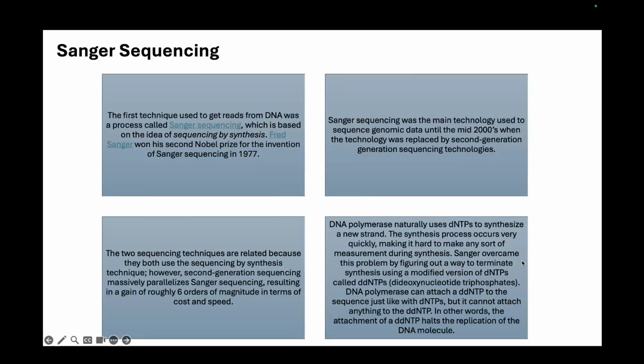The issue is that if you are trying to sequence a DNA strand by synthesis, the synthesis will proceed one after another in a serial way, but you will not know which particular nucleotides are being synthesized.